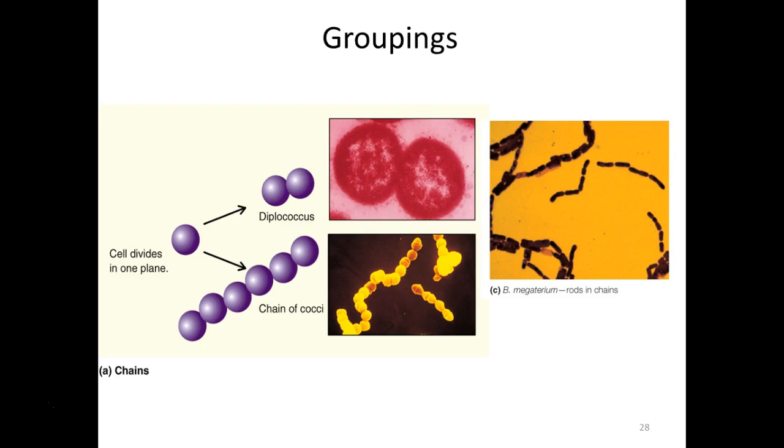And at one time, I think this was a genus name, but I think they're phasing it out. But to give you an example, again, of where this would be beneficial is Neisseria gonorrhea is a diplococci, right? So if they take a sample, they gram stain it, and they see these diplococci, these cocci shaped in pairs, it's a pretty strong indication that that person may have gonorrhea.